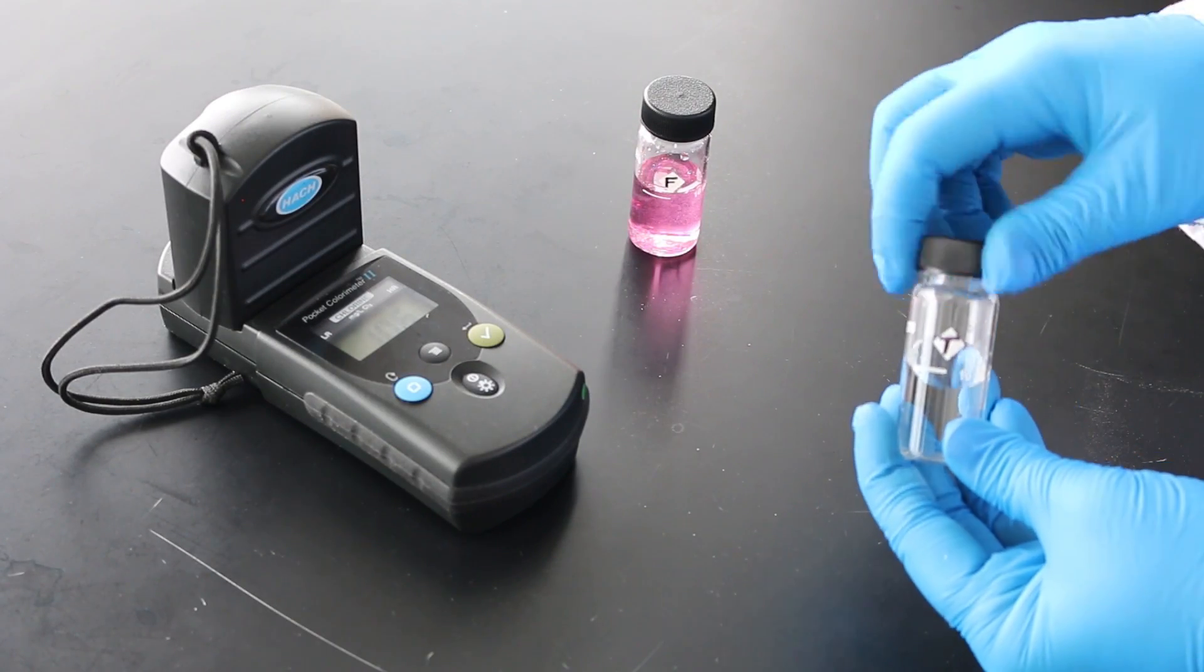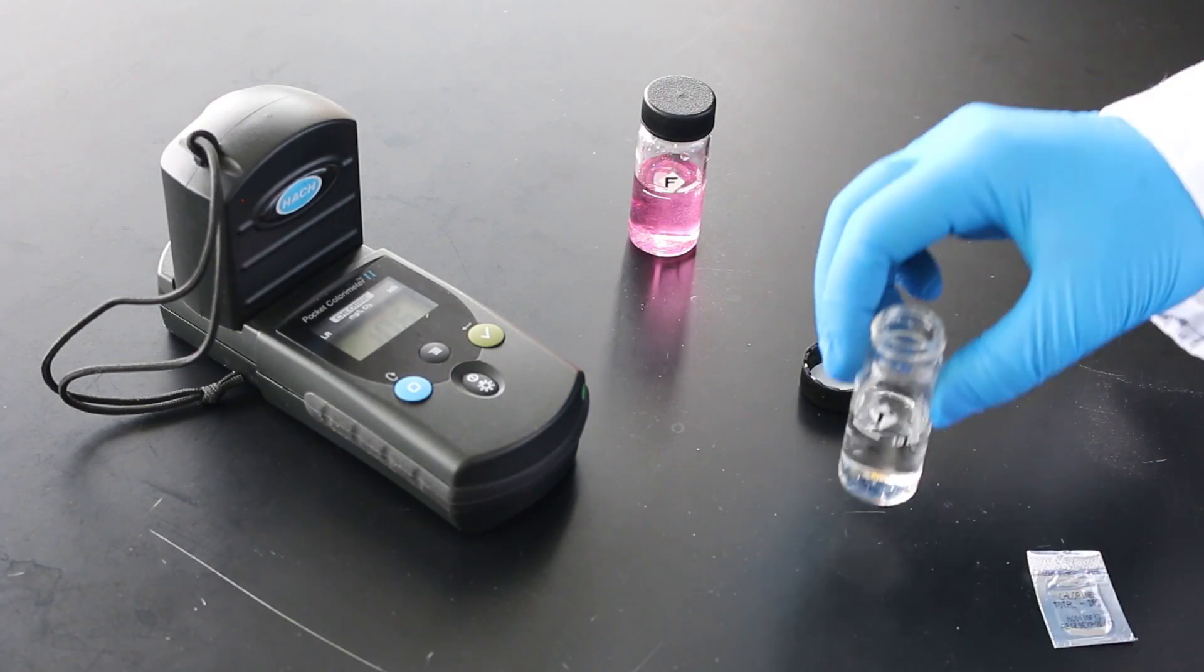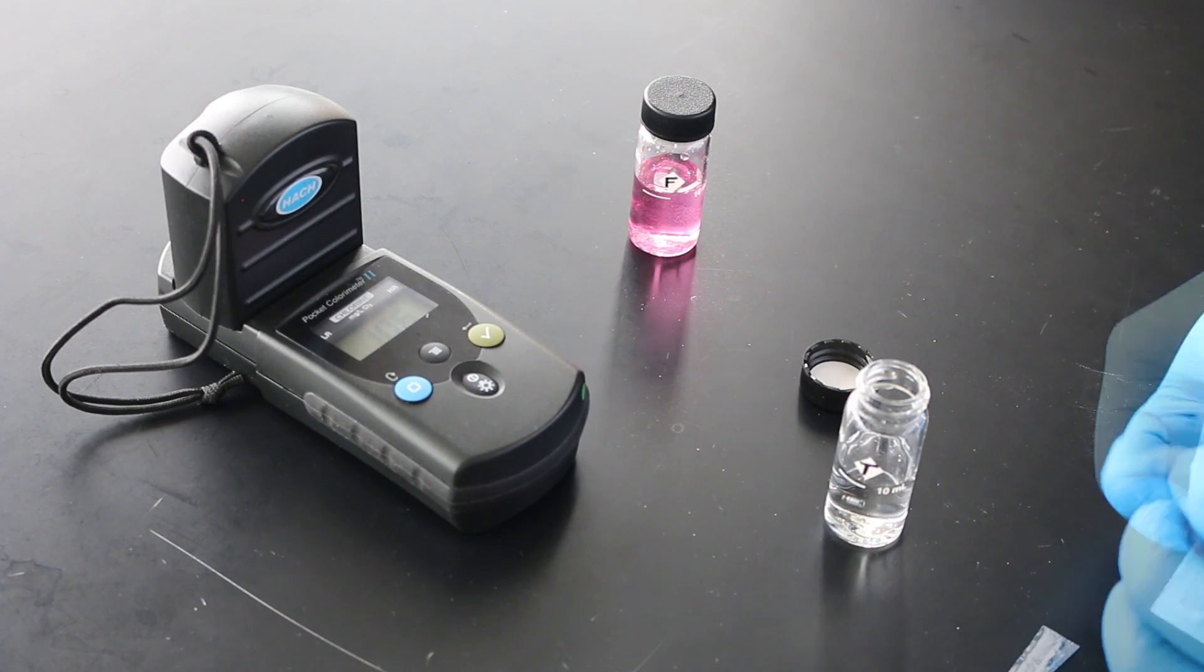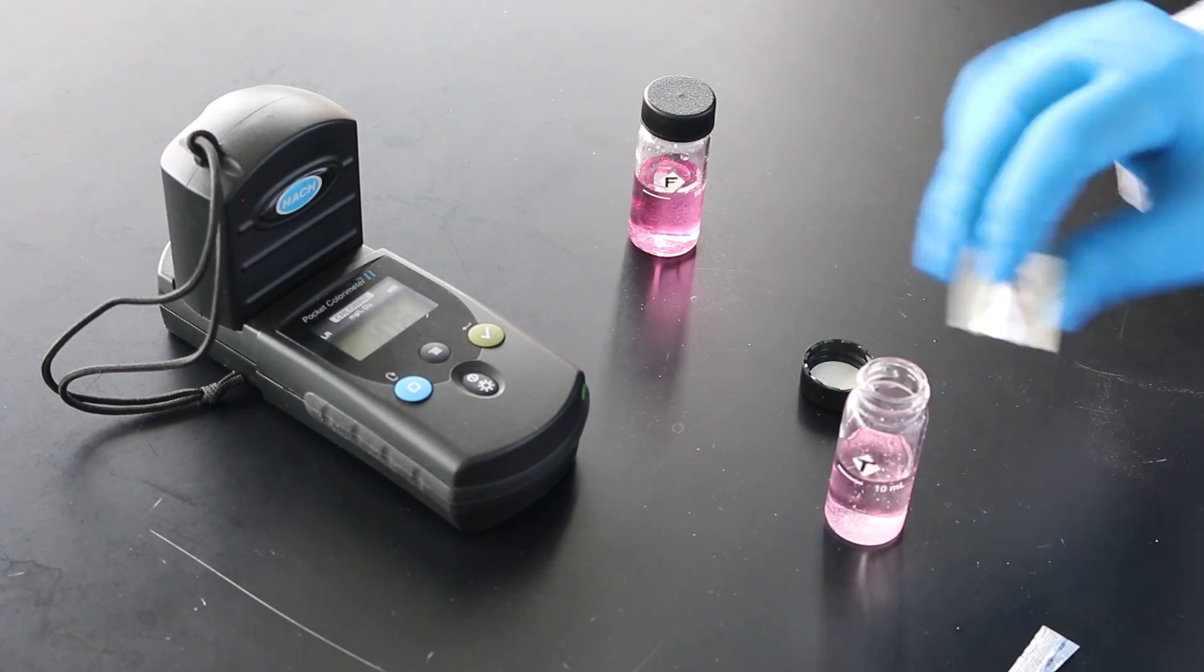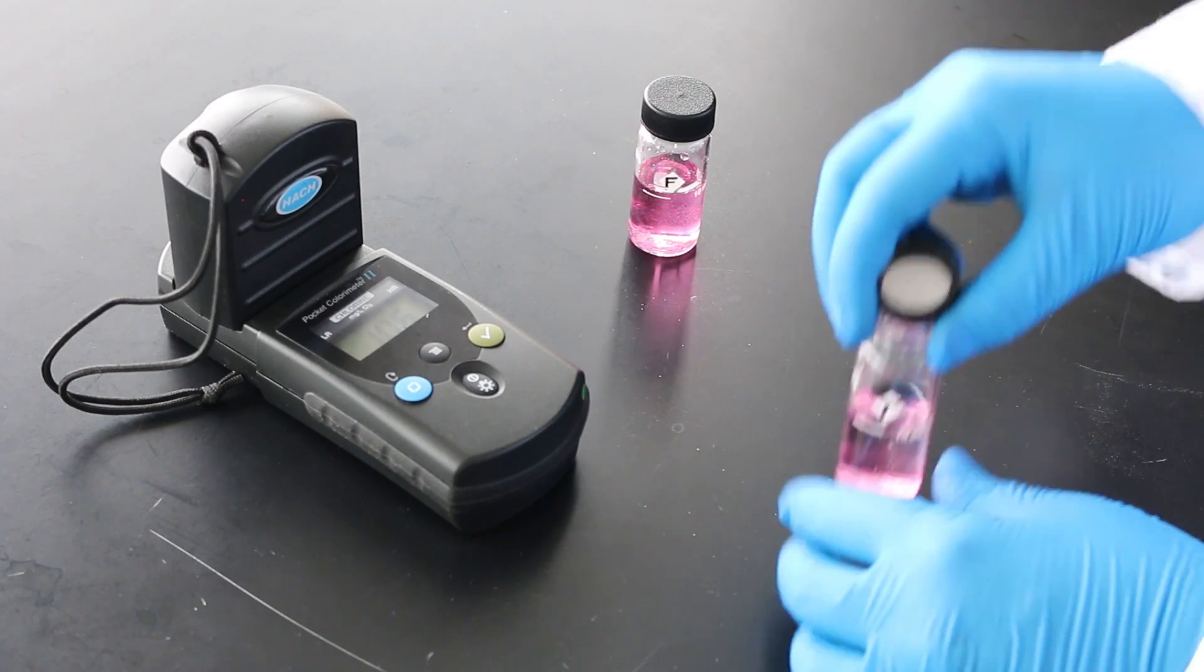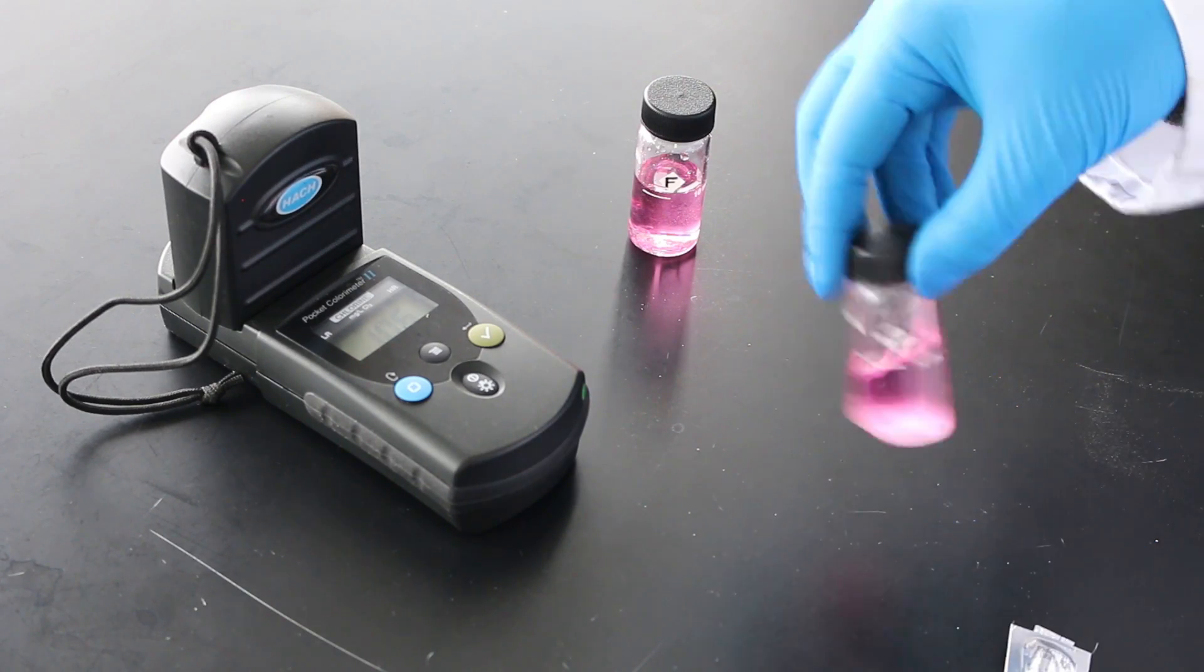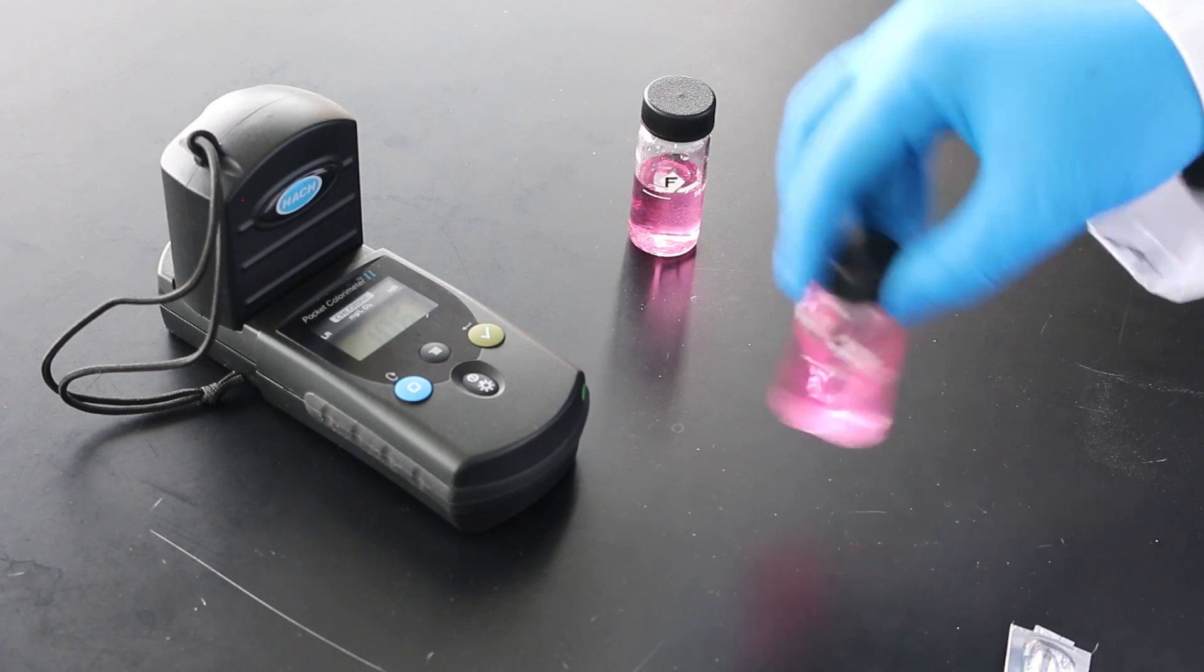It is important to note that if free and total chlorine are both being analyzed by an operator, different dedicated cells should be used for each method. This is because trace DPD reagent can be carried over and will interfere with your residual chlorine readings.